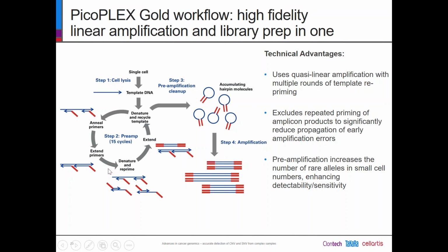Then you will have denaturation and repriming, also with these random primers, and extension, and the sample will go through different cycles of this reaction to perform, as I just said before, whole genome amplification.